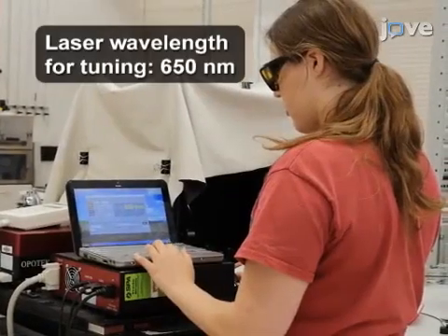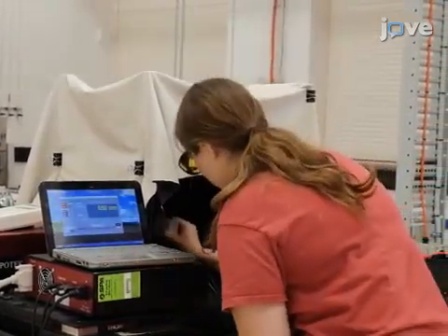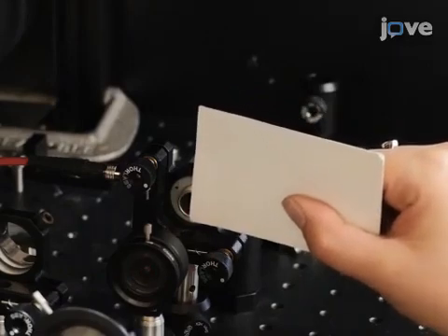With the laser wavelength at the desired value, direct its beam to an off-axis coupler. Use a beam card to check the alignment with the optical axis of the mirror. The spot should enter the coupler approximately at its center.